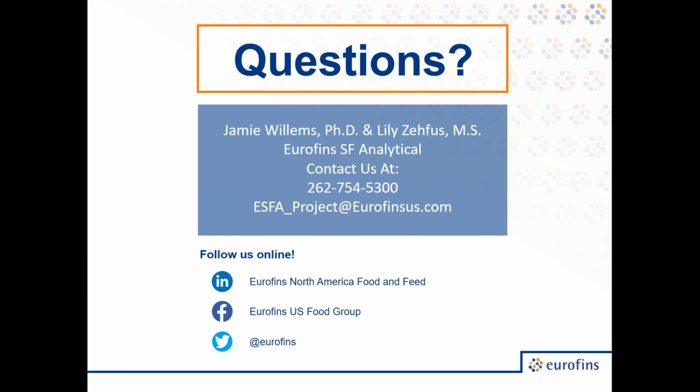Our first question is, can GCMS techniques be applied to products such as pet foods? Yes, this approach can be applied to pet food. As mentioned earlier, we have techniques such as SPME that allow us to apply this to very complex matrices. But we can even apply it to products that a human isn't going to be eating, such as pet foods, by comparing a control and a suspect sample. We've also applied this method to products such as cosmetics and even packaging materials, as Lily mentioned.